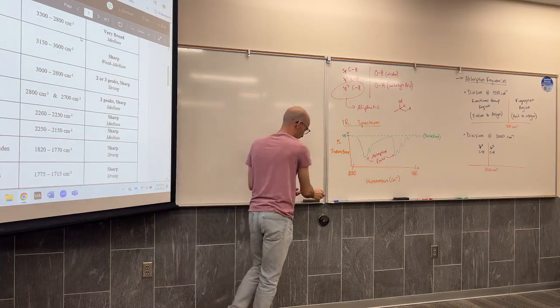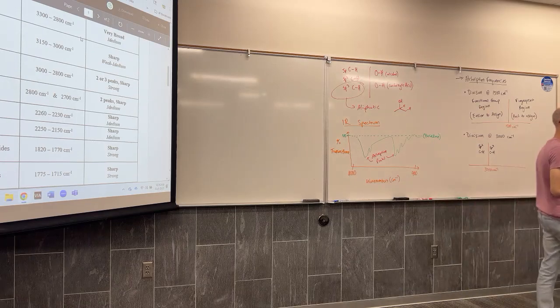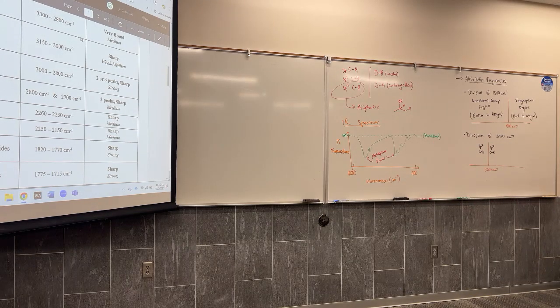Okay, how are you feeling so far? When you're looking at these, are you always having to compare it to the background? No, your instrument negates all. Your instrument takes a background spectrum and then subtracts that from your analysis.